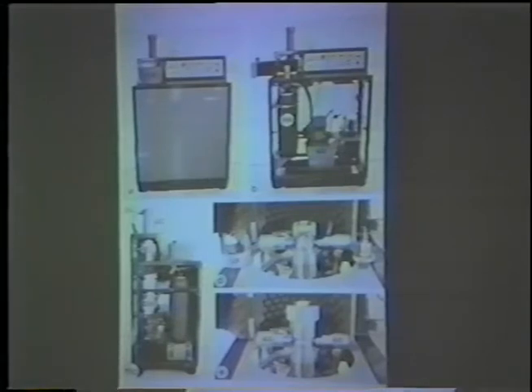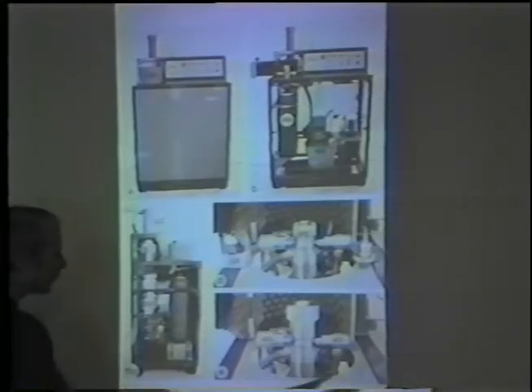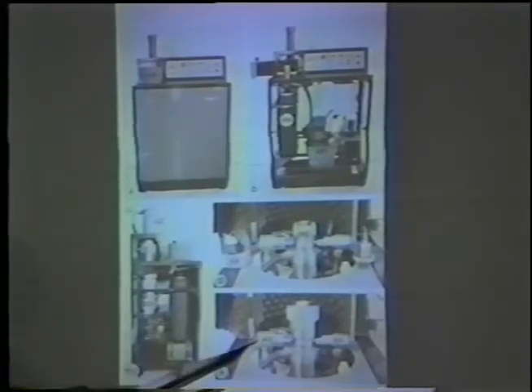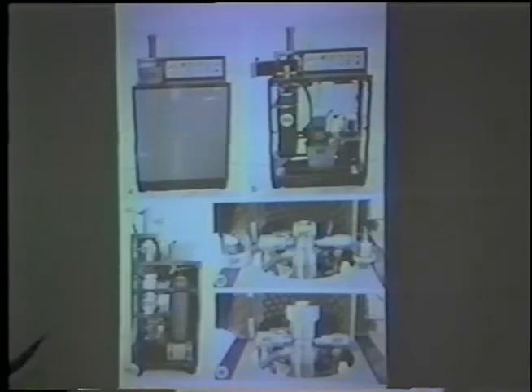I used the original prototype in Moore's lab about 5 years ago, and you had to wear ear protection if you valued your hearing. It was loud. This system has air stones at the bottom of these tubes, which release the pressure slowly enough in here that it's tolerable to be around it. The machine also has a lot of padding inside. The machine shakes the building.